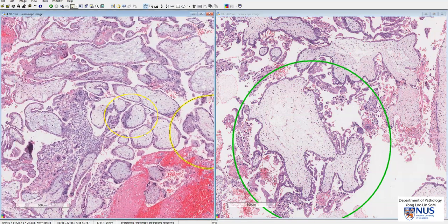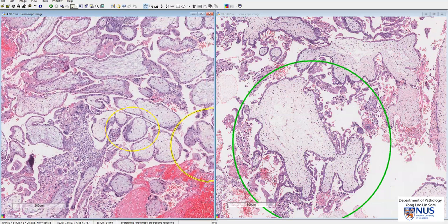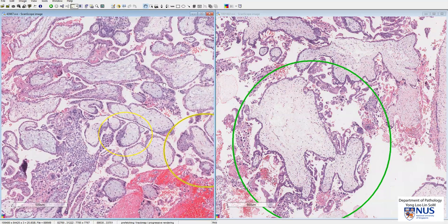Here is another example showing just a little bit of trophoblast proliferation right at one pole of the villus, rather than around the entire circumference.